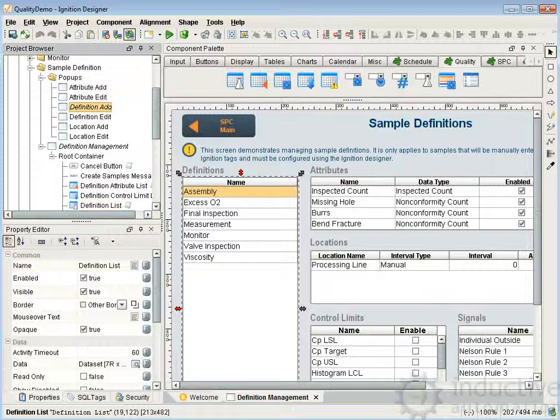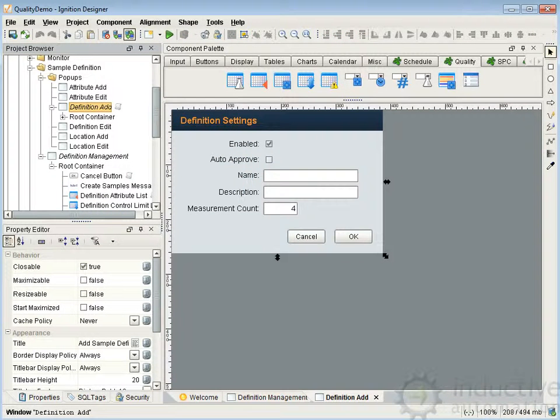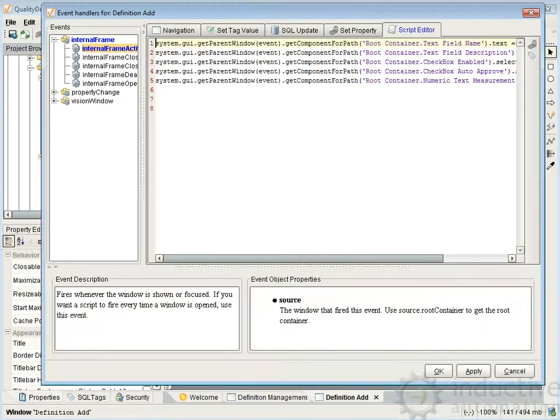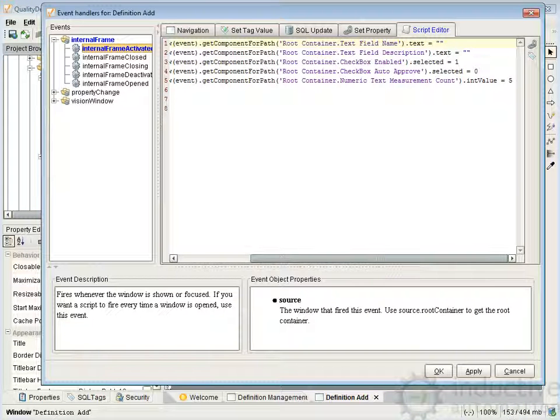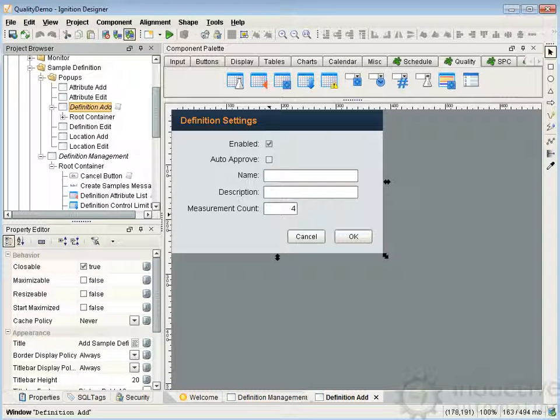Now we'll take a look at the definition add screen. There's some script — pretty minor. When the internal frame is activated, that script is pretty straightforward: all it is doing is blanking out the name field, enabling the description field — it's just pre-setting these fields when the window opens up. Any time we pop that window up by menu selection, it pre-initializes it.